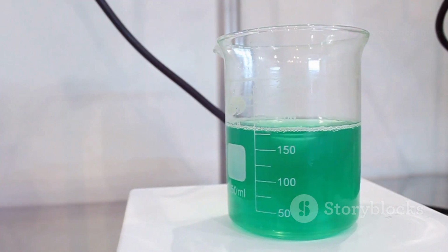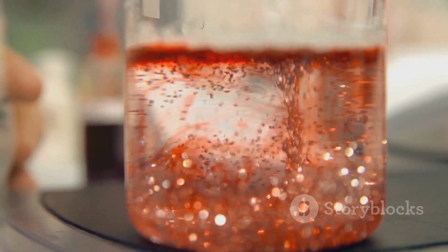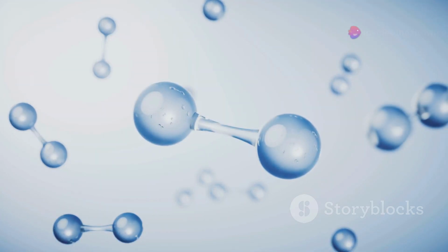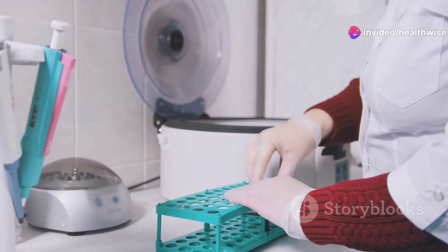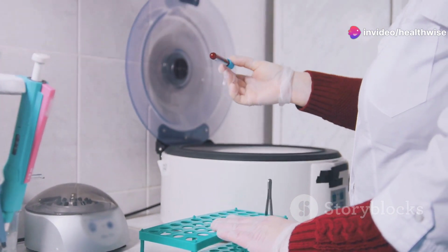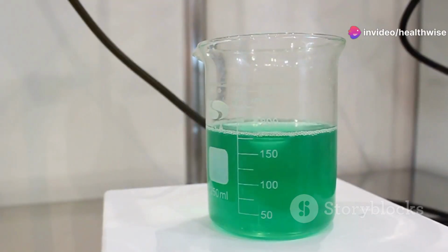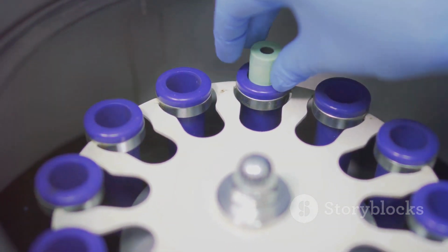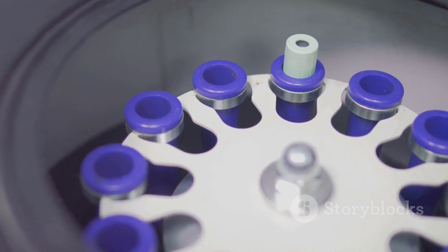We use a porous gel packed into a column. Smaller molecules enter the tiny tunnels and pathways, while larger molecules travel a shorter distance. As a result, the larger molecules come out of the column first, followed by the smaller molecules. This technique is incredibly useful for separating molecules of different sizes, such as proteins, DNA fragments, and polymers.